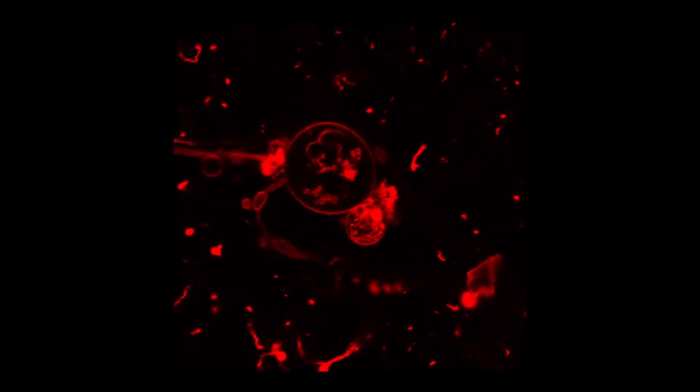This is an image taken by April Corella of DOPC giant unilamellar vesicles generated by electroformation and stained with DII. The image is taken with a 100X oil immersion objective.